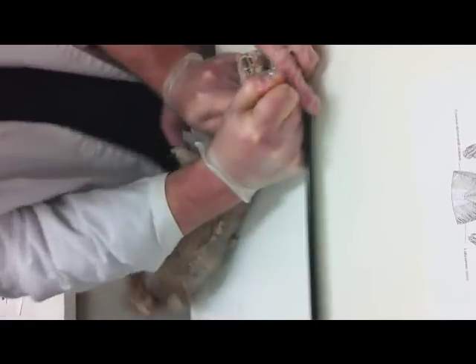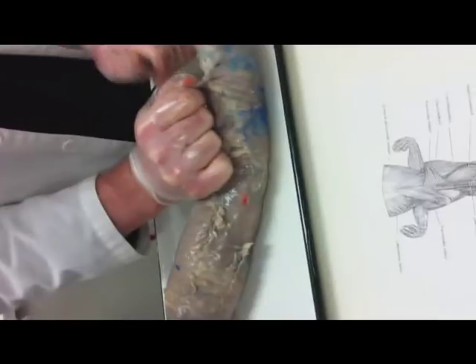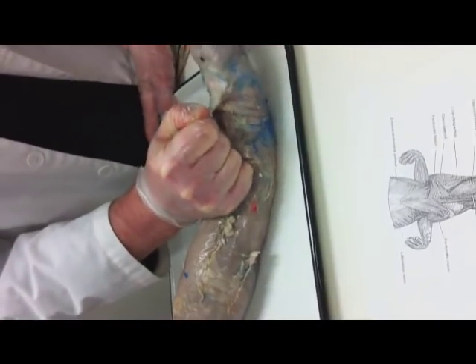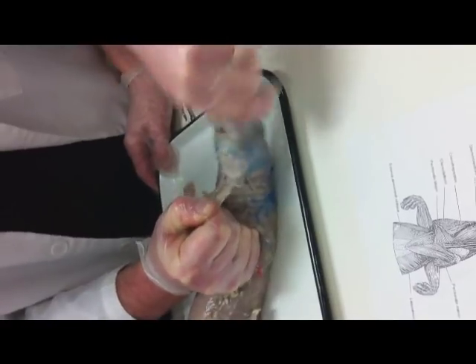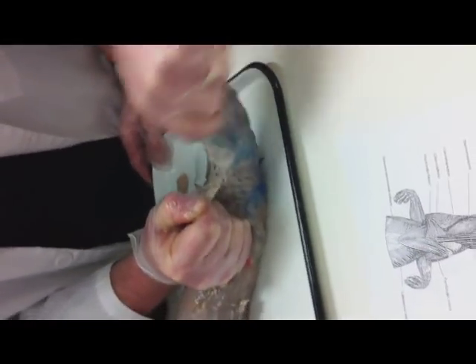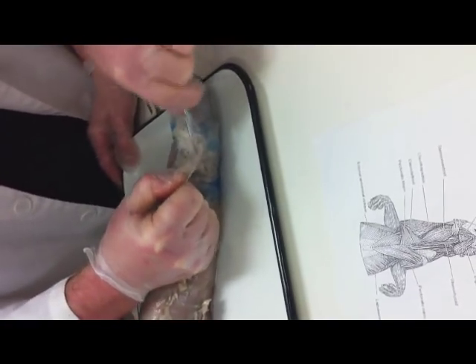Yeah, we call it flicker. Wow, good job. All right. We call it flicker. So someone hold that tray. I'm going to do that again. Thanks. Okay, so now I'm pulling that fat. Ew. What's ew? Got on me. Oh, wow. He flicked mink on me. Mink juice. Mink juice. Juicified.